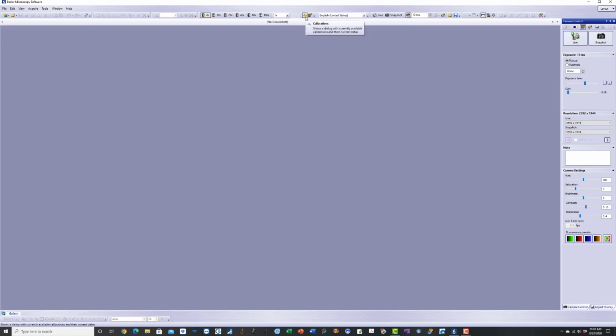This is to put the calibration. This is the device setting. When we play with the device, different brightness, contrast, device setting. Live mode, and this is the capture mode. This is the exposure time. We choose the manual exposure time. This is the acquisition setting.